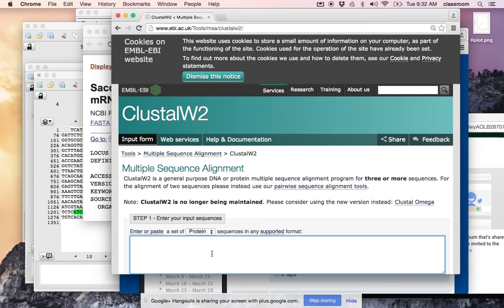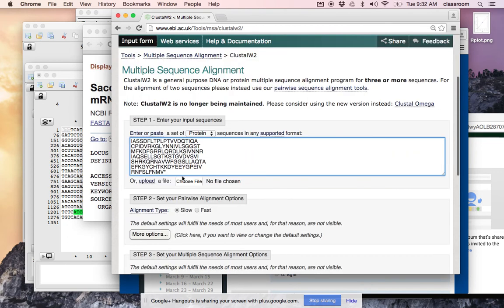You need to know how to put a sequence in FASTA format. So greater than sign, wild type. Make sure you switch to a new line when you copy paste the sequences. The sequence cannot start right after the greater than sign, otherwise you will lose information. And then I'm going to put mutant 1.